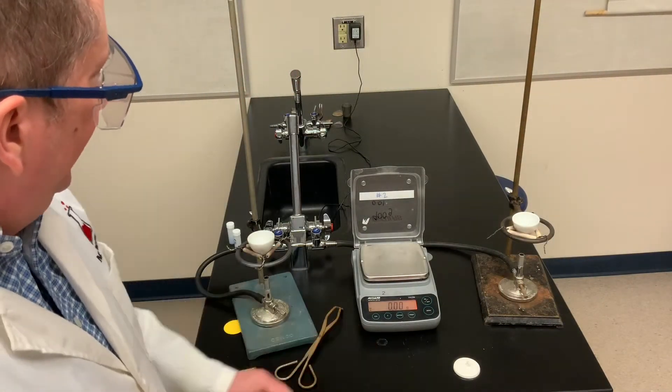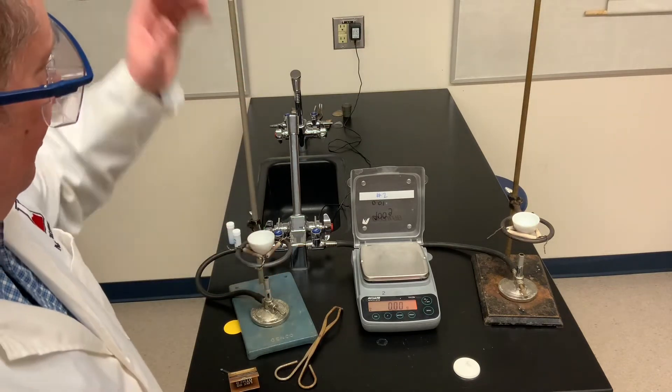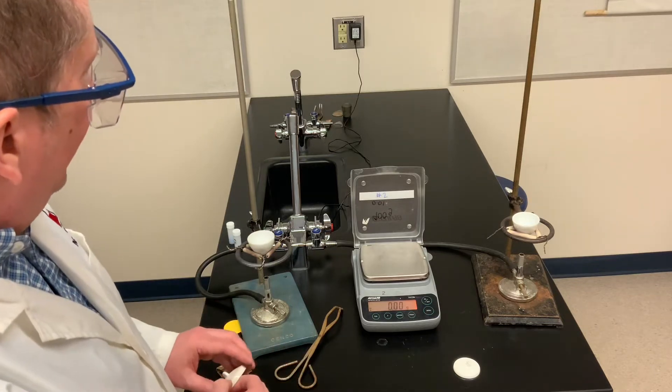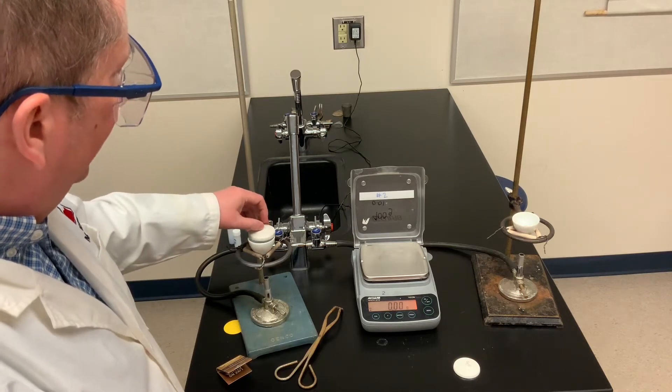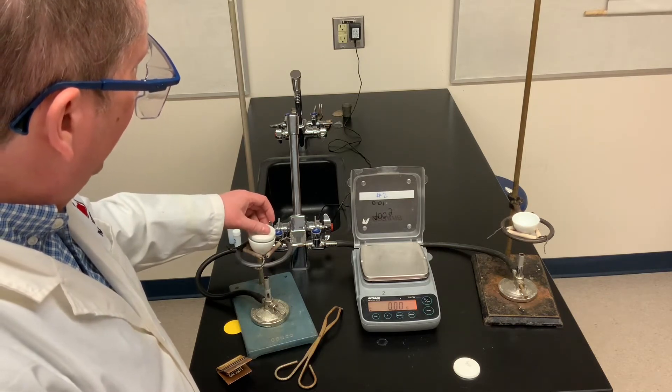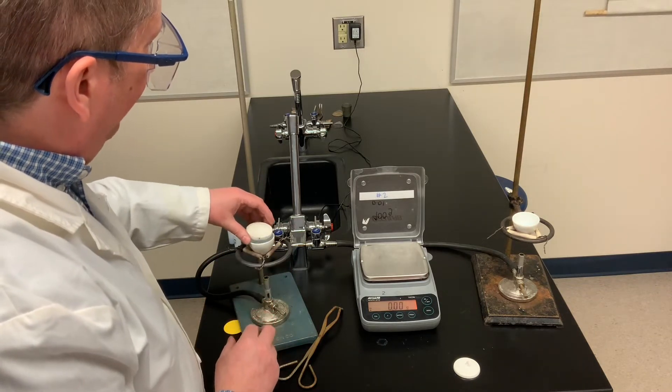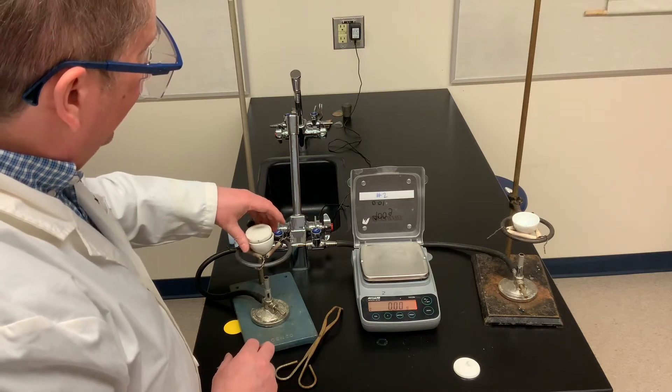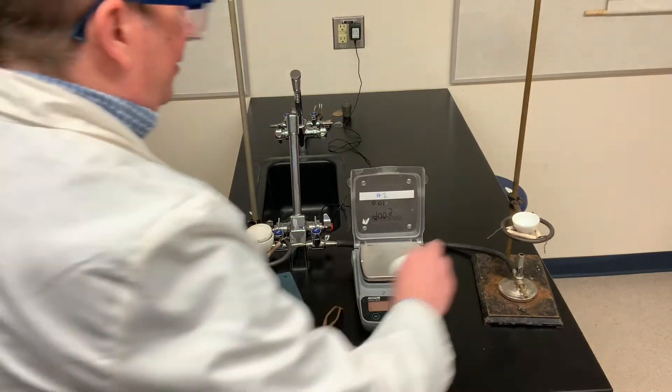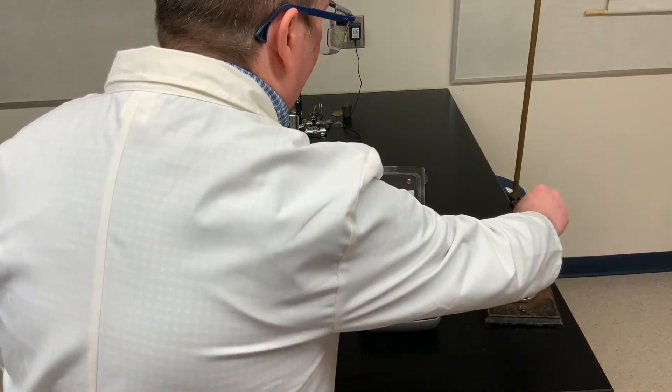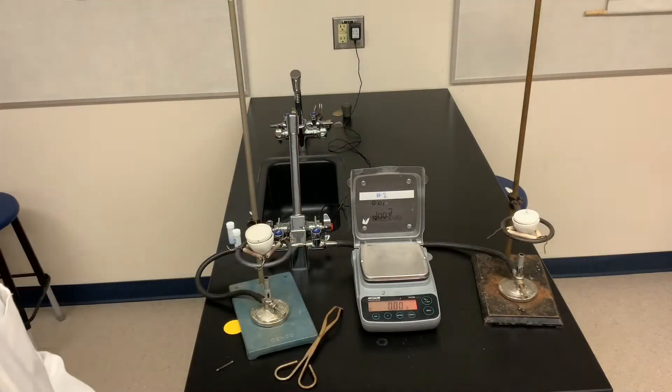Now as we heat the salt, the water of hydration is going to escape and come out to the air. But it is possible that there could be some spitting of the salt. So we're going to cover the crucibles with lids, but not completely. You don't want to cover it completely because we do want the water to escape from the crucible during the heating. So notice I'm leaving a bit of a gap for the water to escape. And now we're ready to start heating.